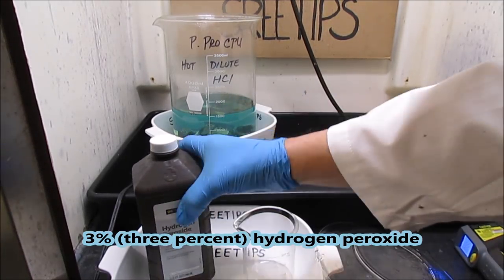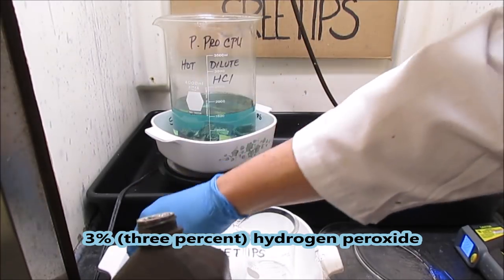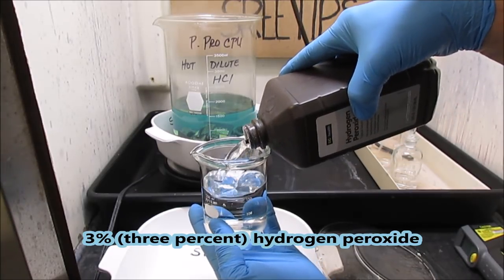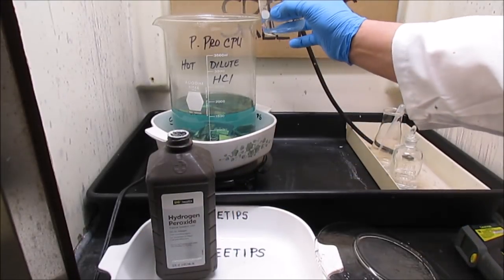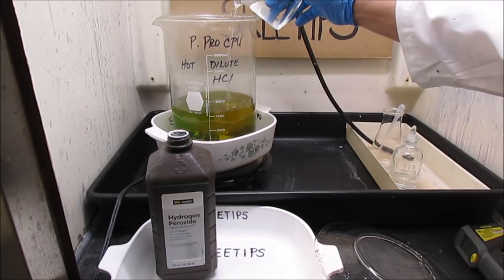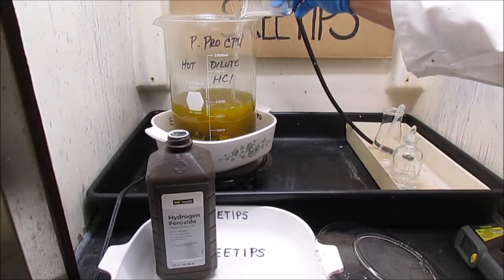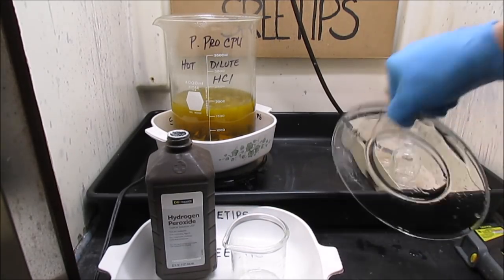And now what I'm going to do, I've got some drugstore hydrogen peroxide here. I'm going to measure out about 200 ml and add this to the beaker here, see what happens. That's 200 ml of 3% hydrogen peroxide.